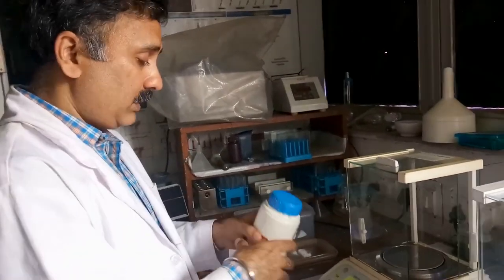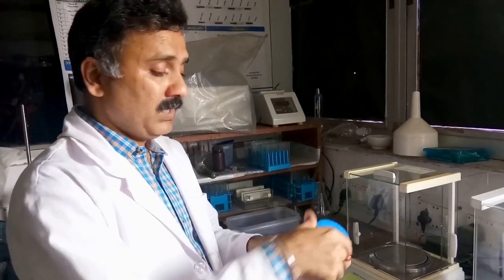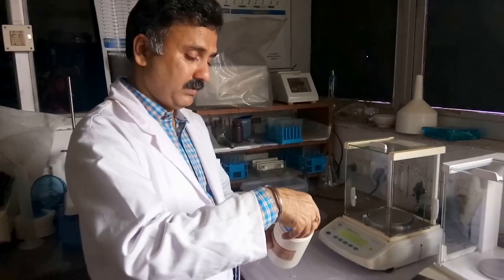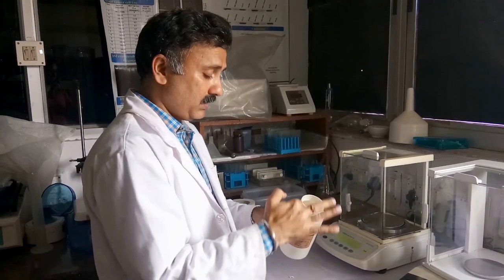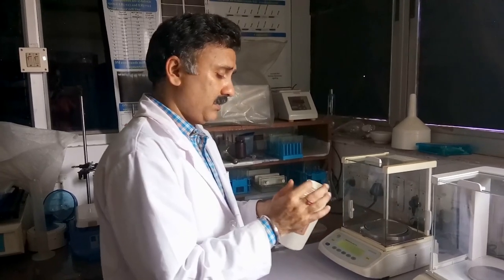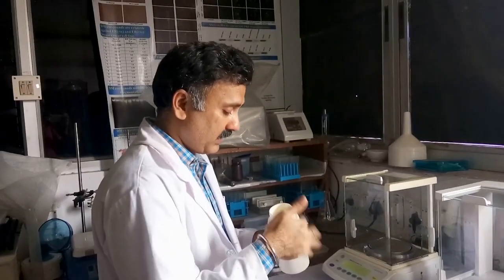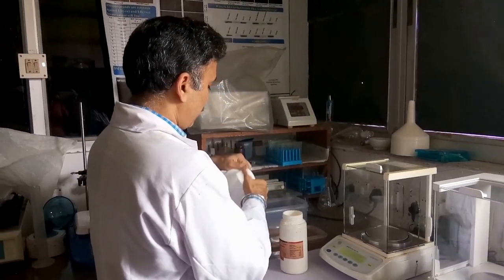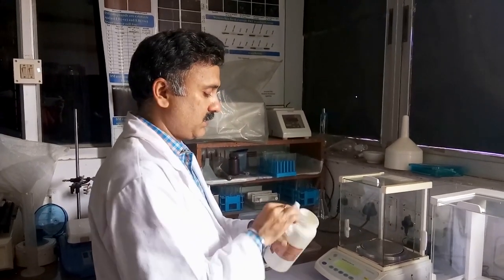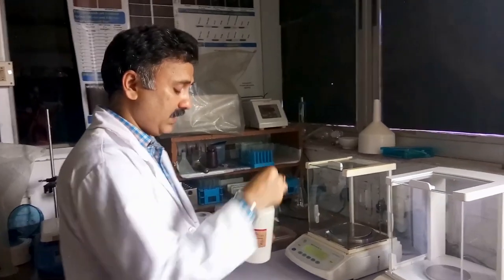Remove the eppendorf and open the reagent bottle. Ensure the rim of the cap or bottle is clean — it should not have any salt or dust deposited on it. You can use a small piece of tissue paper to clean the rim so that no contamination gets into your compound. Different spatulas are available: a large spatula for gram-range measurements, a medium spatula for sub-gram range, and a small spatula for very small amounts.